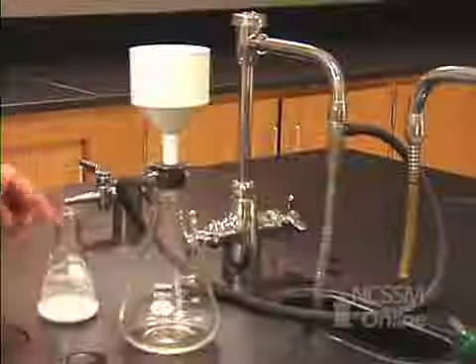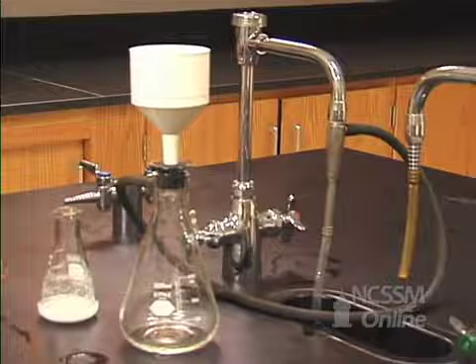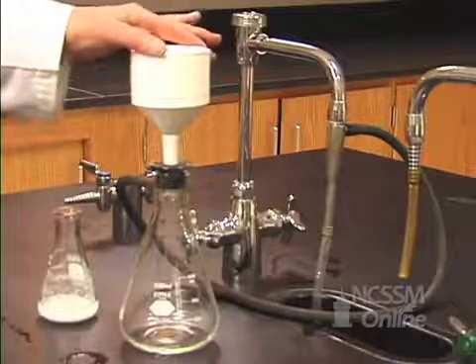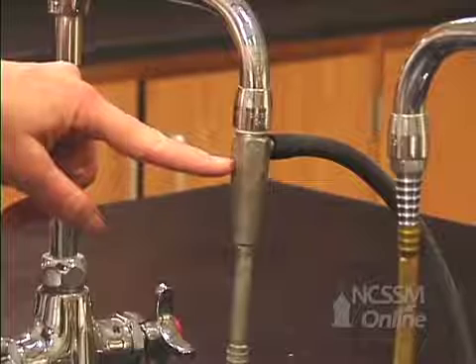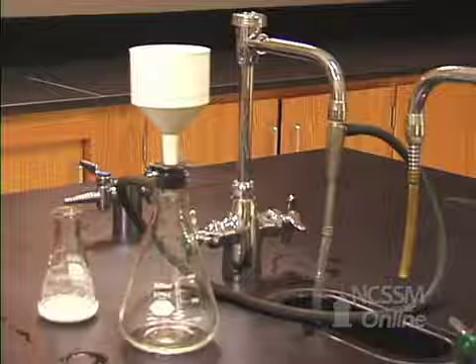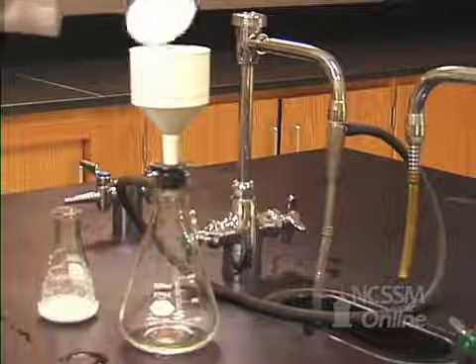Now what we need to do is to filter our aspirin from the solution. And to do that, we're going to use a sidearm flask and a suction filter and this aspirator. The aspirator creates a low pressure inside our container here, and that will help gravity pull that water out and leave our aspirin inside the funnel.